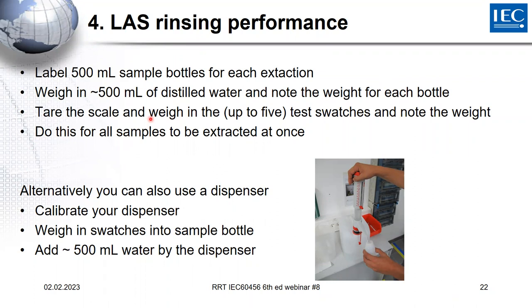At this moment, you don't put the swatches into the bottle, because this is the important time step. So first you weigh all the swatches, and then within a short time period, you take those swatches and put them into the bottle.